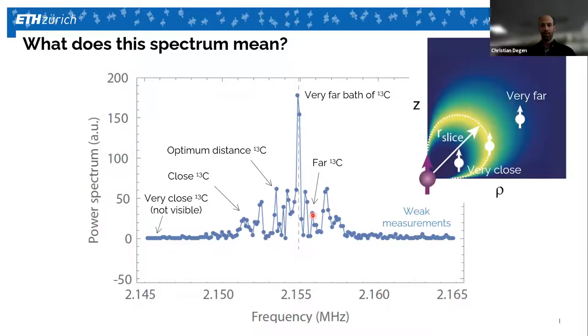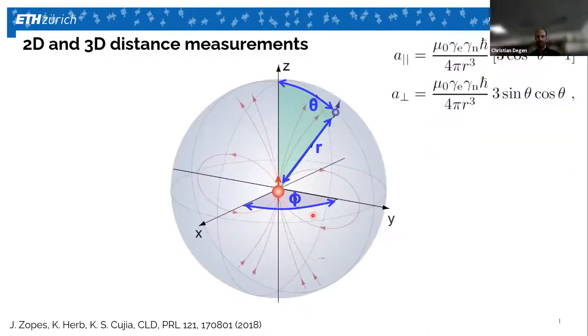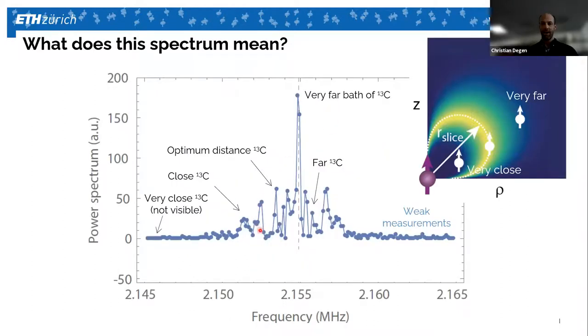Let's now turn to the quantitative analysis, and this all relies on the dipolar interaction. This is the part that you will know well. How can we analyze this in terms of NMR couplings? We have two components that are important, the parallel and the transverse hyperfine coupling parameters, which would be the secular and non-secular parts of the dipolar coupling. We can measure both couplings individually, and they give us a number for the radius r and the polar angle theta. They're encoded, if you go back here, in the peak height, which is the non-secular term, and the distance from the central line, which is the secular term.